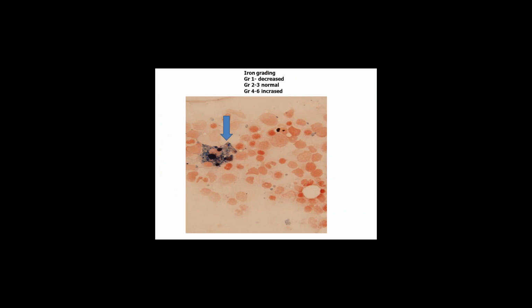The other thing that we have to do once we get the bone marrow is to always do an iron stain. Make it a habit to put up an iron stain in each and every case, whether it is a leukemia or anemia or something else, because that way it helps us in two things. First, we get a control from cases in which iron is present, because for iron a control slide should always be stained.